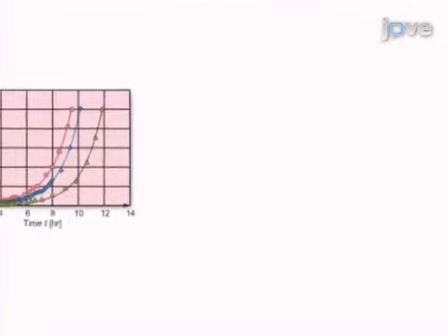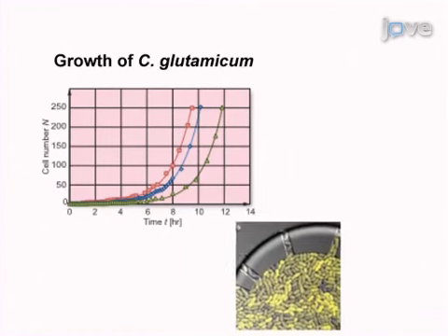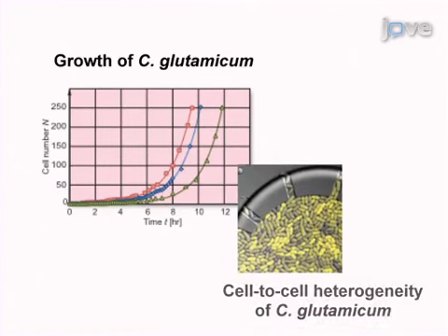Results are obtained from automated time-lapse microscopy showing the cultivation of an industrially relevant strain of Corynebacterium glutamicum, growth data, and cell-cell heterogeneity.